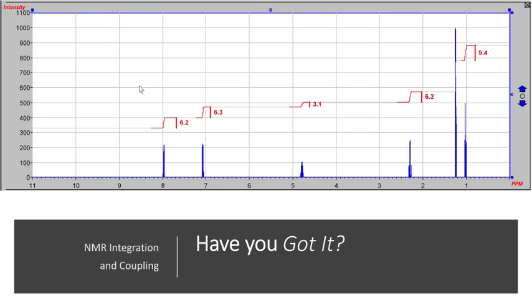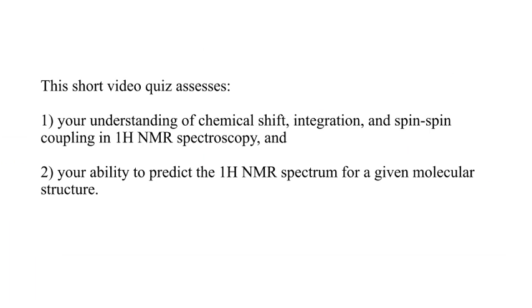NMR integration and coupling. Have you got it? This short video quiz assesses your understanding of chemical shift, integration, and spin-spin coupling in proton NMR spectroscopy, and your ability to predict the proton NMR spectrum for a given molecular structure.